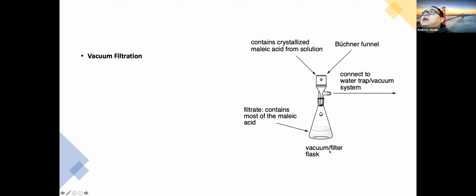So here's our vacuum or filter flask. It's also called Buchner flask because this guy developed this glassware for these types of procedures to isolate products from reactions. So it's some history here. Okay, so we wash the product with water.